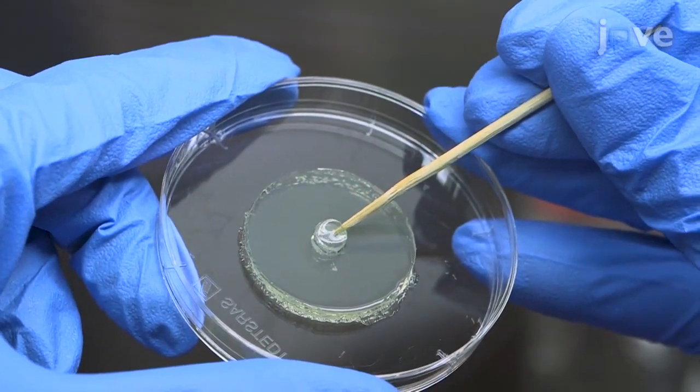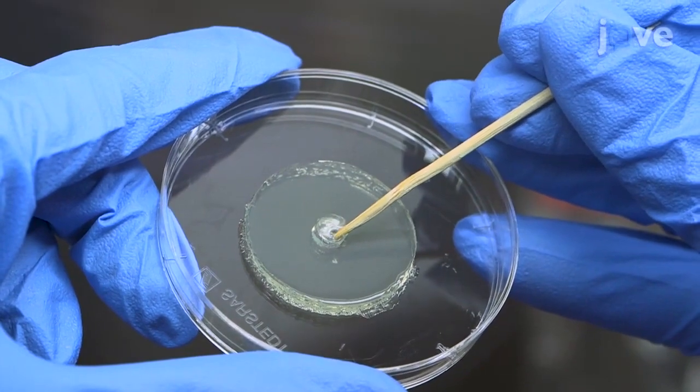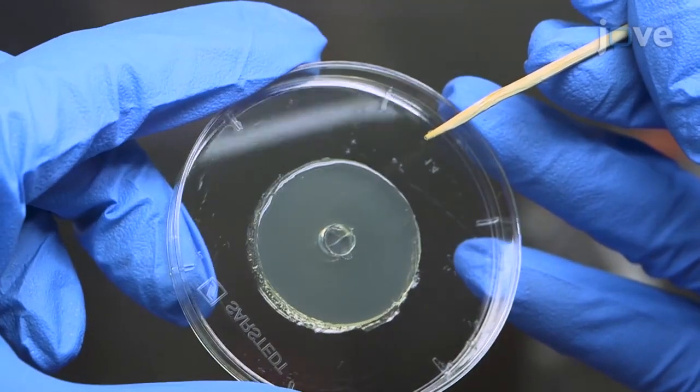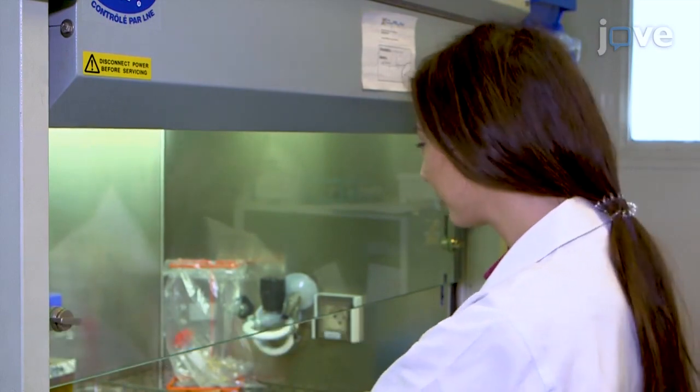This method can provide valuable information about the mode of application of plant-derived products and is particularly well-suited in the field of biocontrol. Demonstrating the procedure will be Valentina Gligarijevic, an engineer assistant from the SUP Biotech Laboratory.